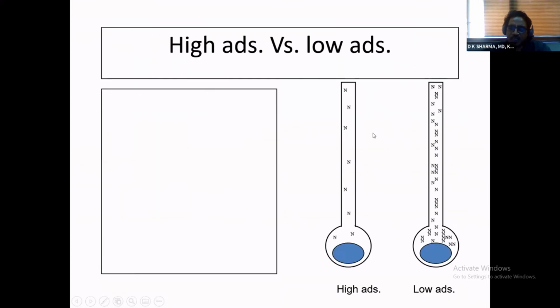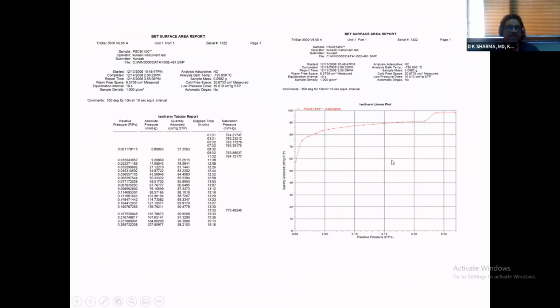Another important thing, this was about low versus high adsorption discrepancies. Another thing is your equilibration. Remember, in the very first slide, second or third slide, I said all these measurements need to be at equilibrium conditions. The reason I said that was because all the modeling and all the equations that you want to use to find out surface area assume equilibration.